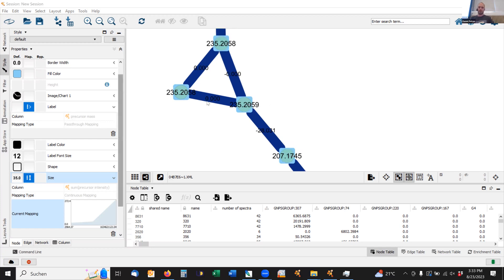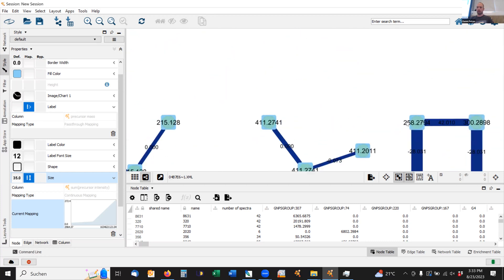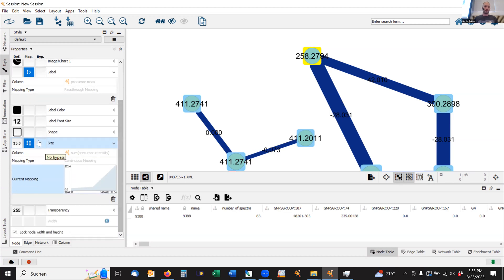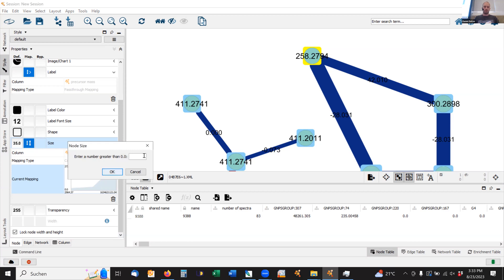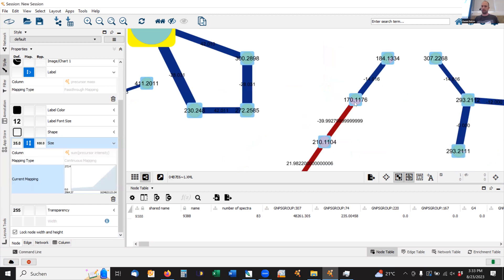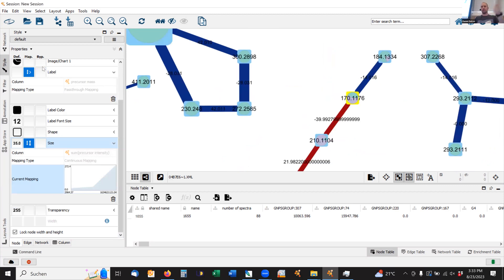Let's say we find one really cool new biomarker with mass 258, and I want to always find it again quickly. The easiest thing would be to mark it with a color or make it bigger. If I select one single node and go here under size in the bypass tab and put in any value, let's say 100, I can bypass the mapper and make this node bigger. And yeah, that works for color, size, whatever category. So that is pretty useful.